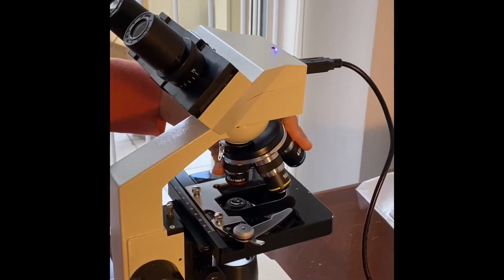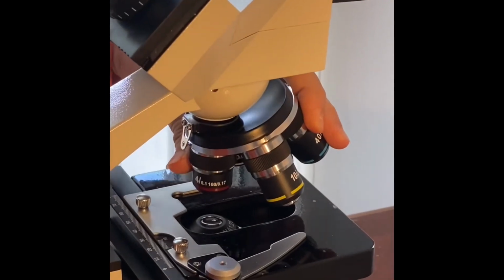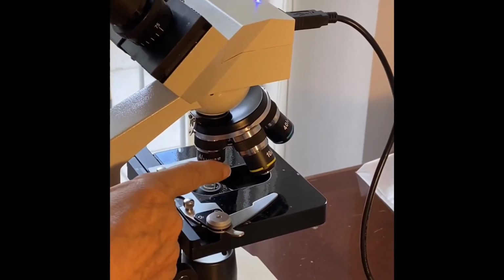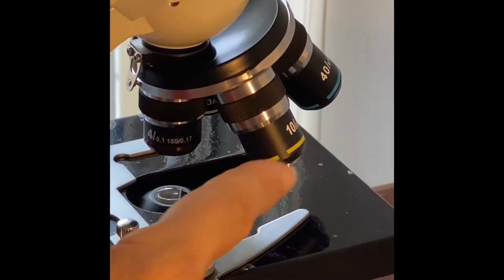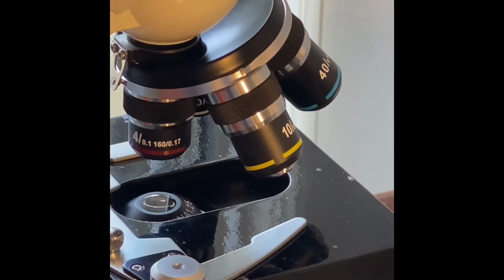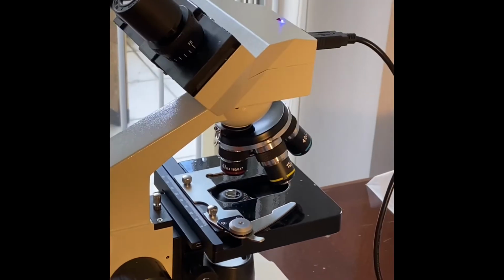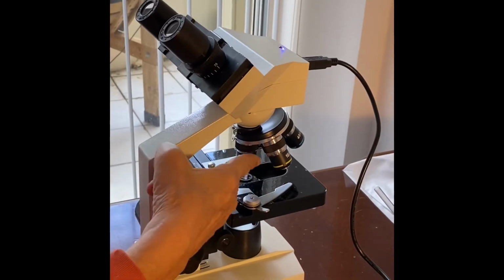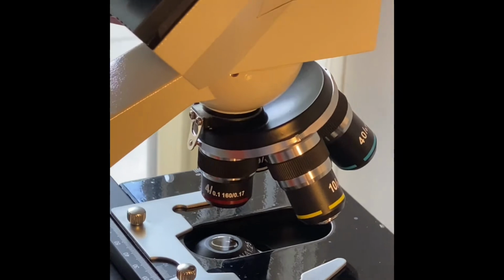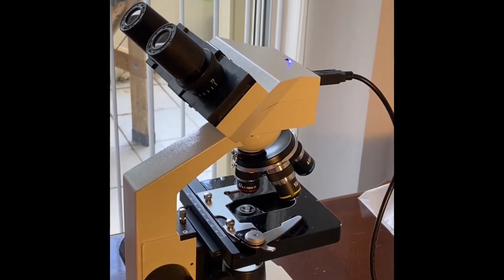You will always have the lowest objective from 4x in this microscope to 100x. All you really need is a 4x and a 10x objective lens. That would be this one and this one to do what we need to do in these biological activities.